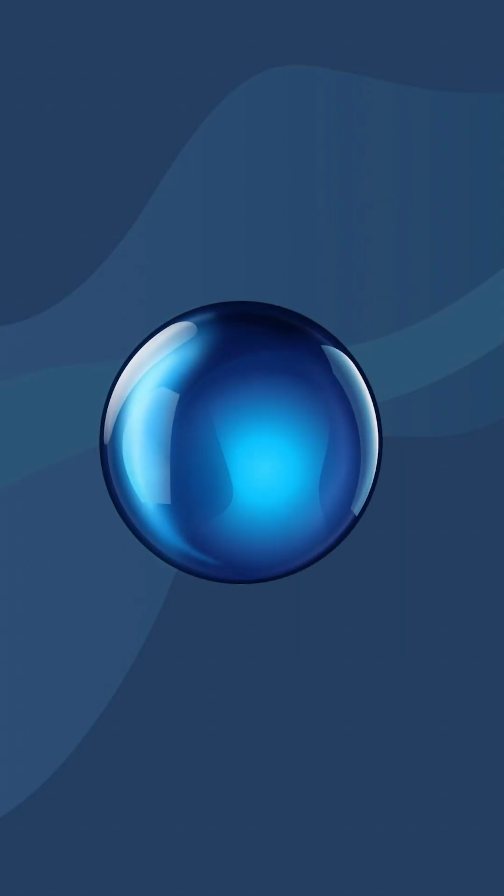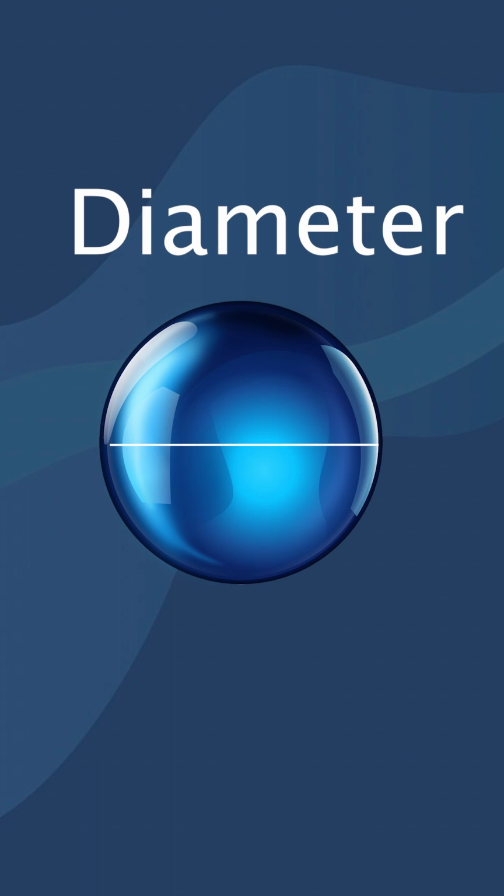The D10 indicates that samples at that size and smaller make up 10% of the sample volume. The D50 is 50% and the D90 is 90%. Size is measured as if each particle were a sphere by diameter in nanometers.